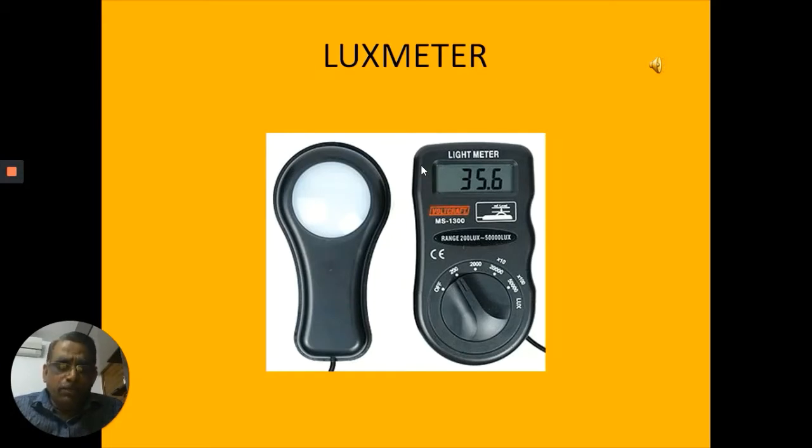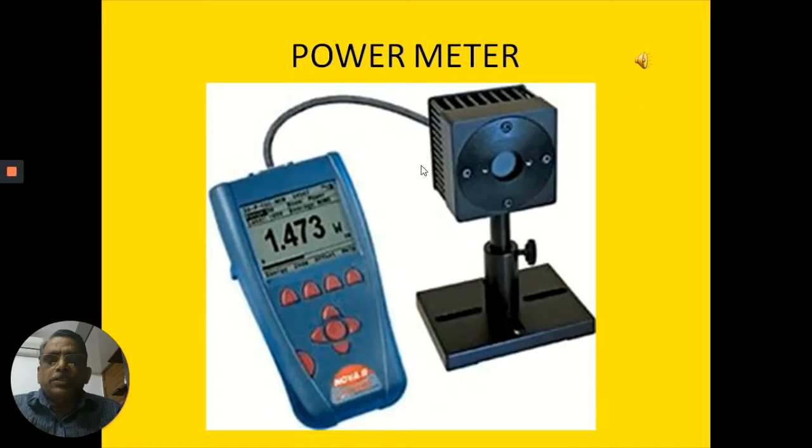In many light applications, it is possible to measure the intensity using a luxmeter. Now you can use a power meter if you are measuring the intensity of a very intense light source like lasers. We'll be learning more about this power meter when we study lasers. They have the detector, otherwise you call them a sensor.